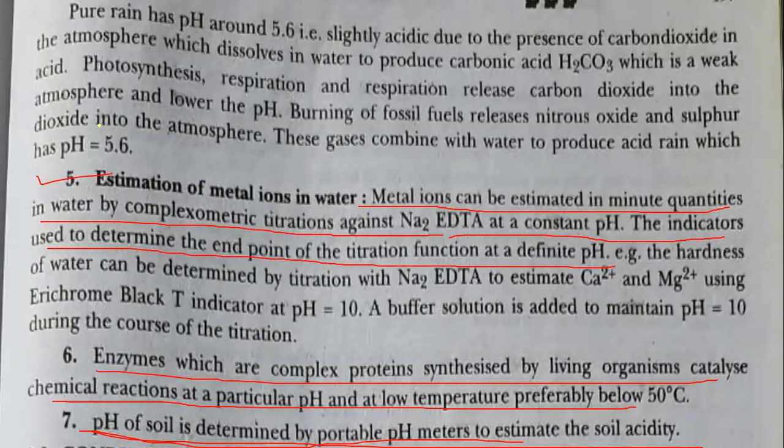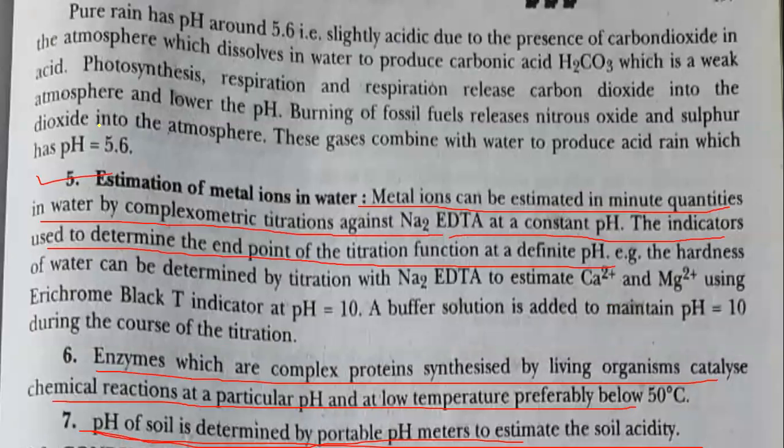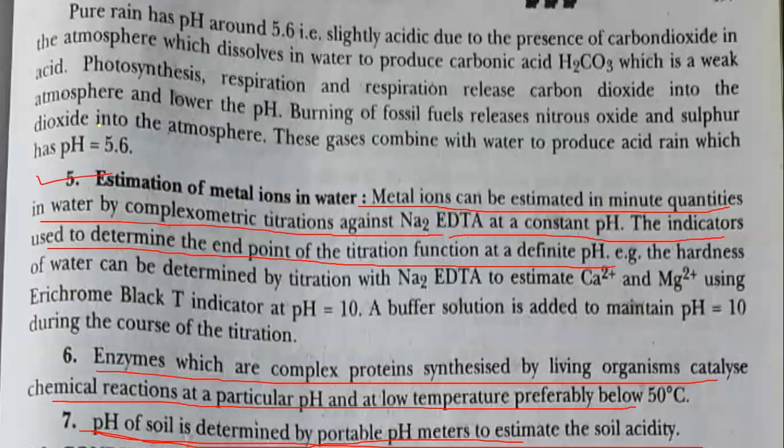After this lecture, there will be the last instrument from this unit, that is conductometry. After finishing conductometry, your unit two will be over. So for this lecture, I think the pH meter is enough. In the next lecture, I will continue with conductometry.